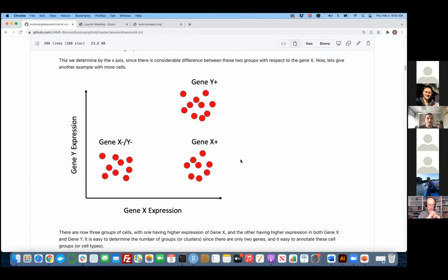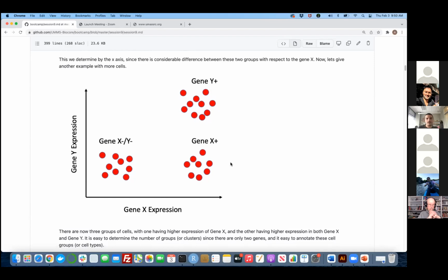By the way, I'm going to be questioning your biological knowledge as well, and I'm going to ask you what you believe some subpopulations are based on the data that we see in R. So yes, that is what we are doing. There are some algorithms for automatic annotation, because some cell subtypes are quite obvious. Like if you have a lot of CD3 in some subpopulation, it's obviously some T cell and lymphocytes.